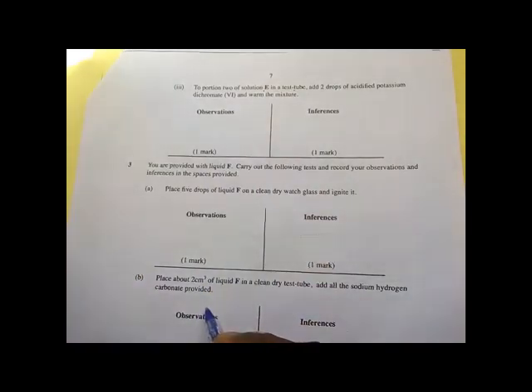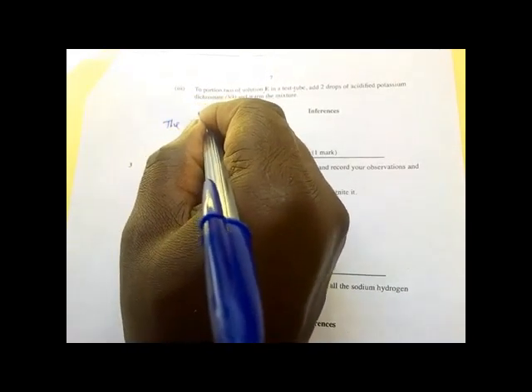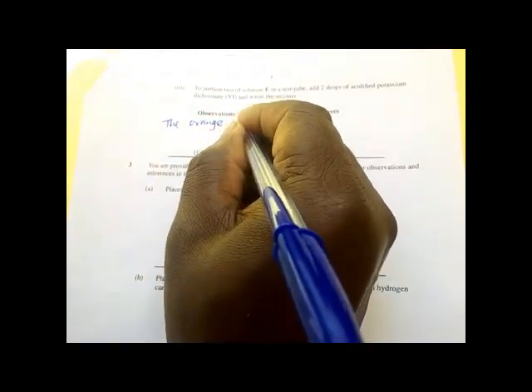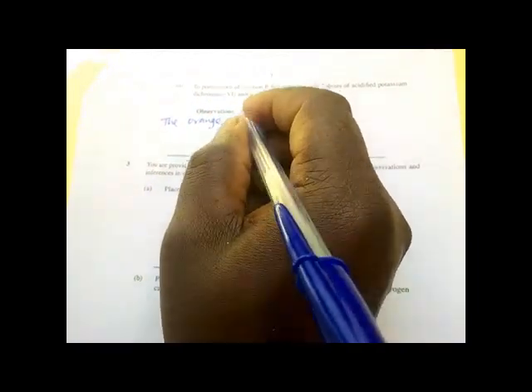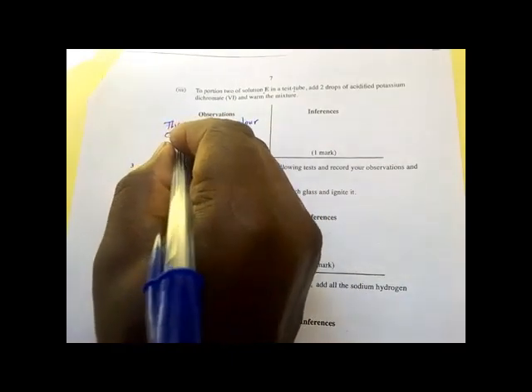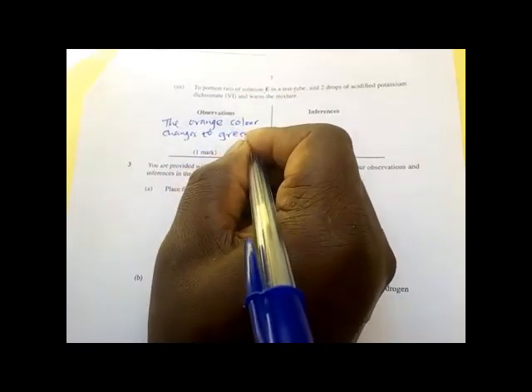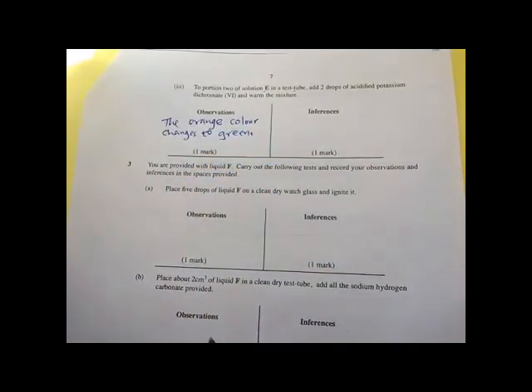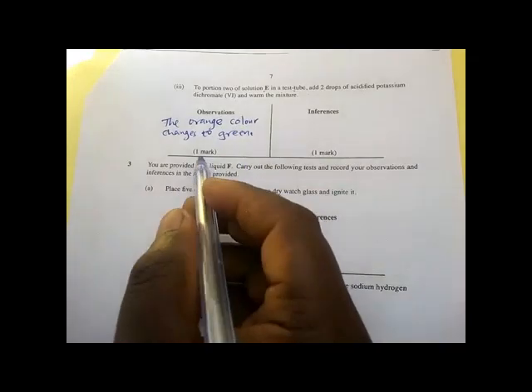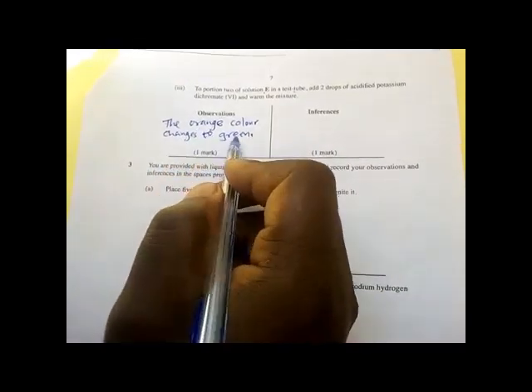Then the orange color changes to green. Or you can say the color changes from orange to green.